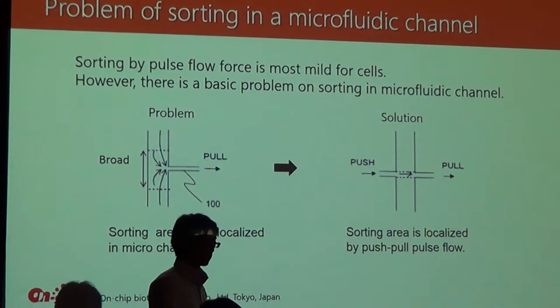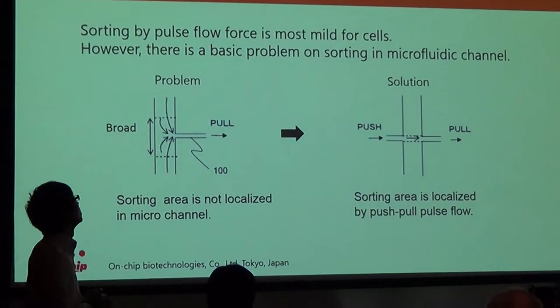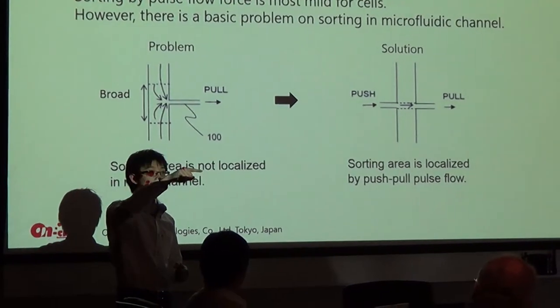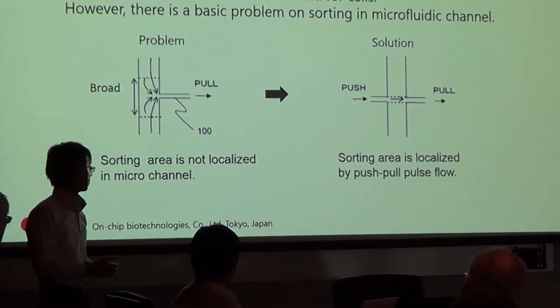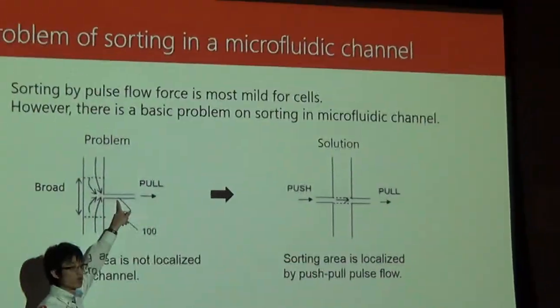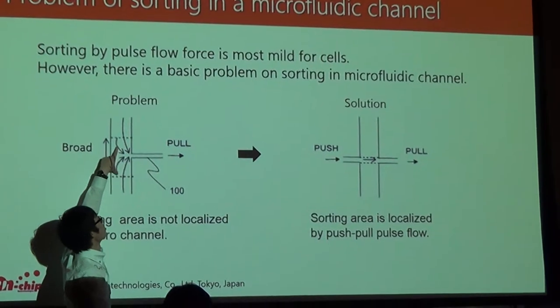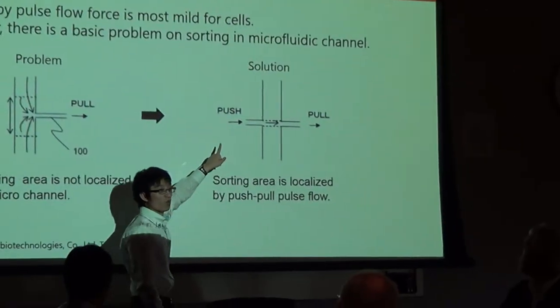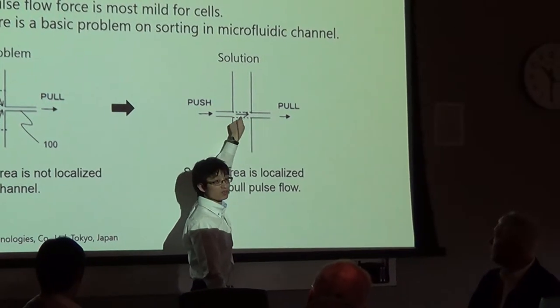And just going back to the fundamentals of sorting, we sort these cells using what we call pulse flow force that knocks off cells running through a channel, by applying a pulse to knock it off to the side channel. And the problem that we have, if we were to have just one single channel and drive the cells this way, we have to apply pressure from both sides, and this much of the fluid that's suspended in there also goes in. Whereas on our chip, because we have an intersection of channels, only that much of the fluid would go into the side channel.